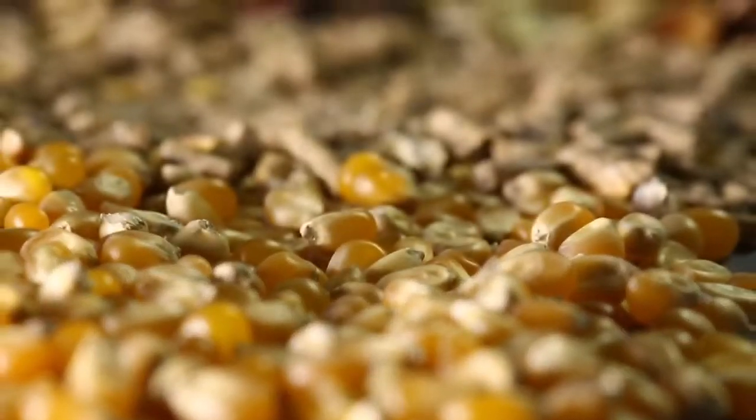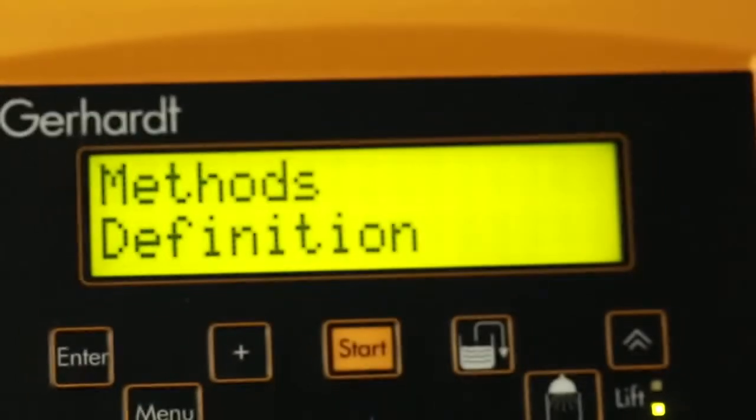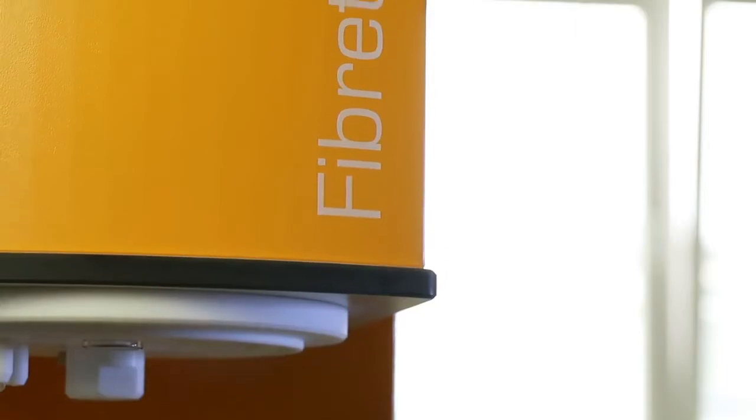Traditional fiber analysis is a time-consuming, multi-stage process. The fiber-backed technology developed by C. Gerhard considerably simplifies the process.